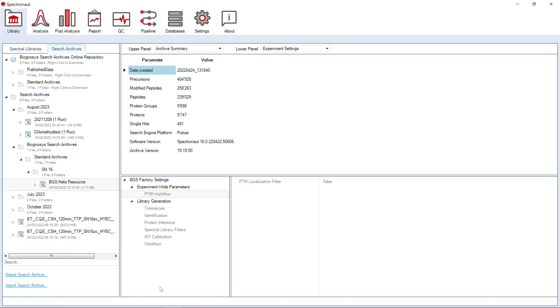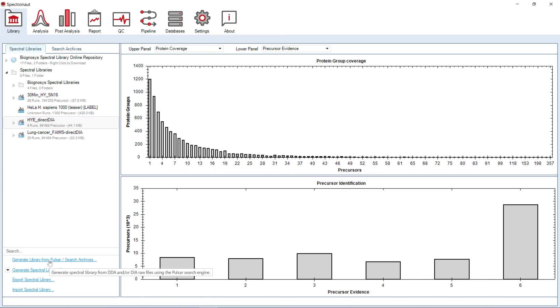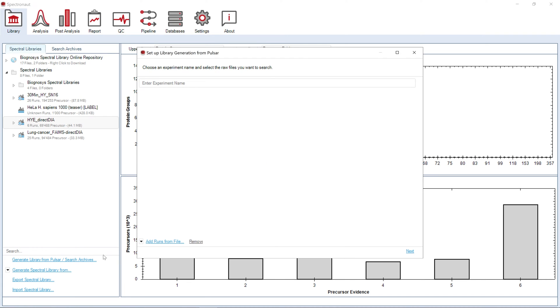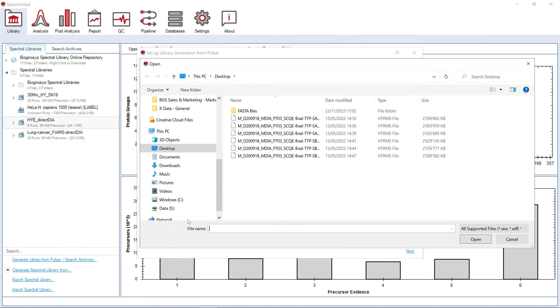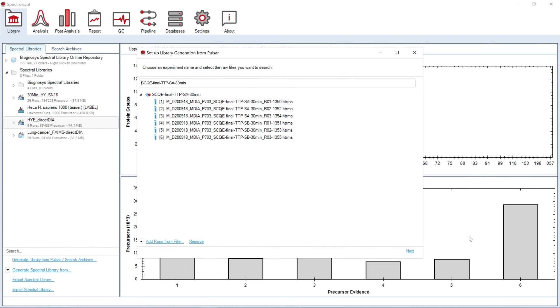Let's generate a library. We will start by uploading data for the library generation. Pulsar will generate a spectral library from DIA or DDA data. If you acquire DDA data for library generation, we highly recommend using both DDA and DIA files at the same time, as hybrid spectral libraries perform much better than classical DDA-based libraries.